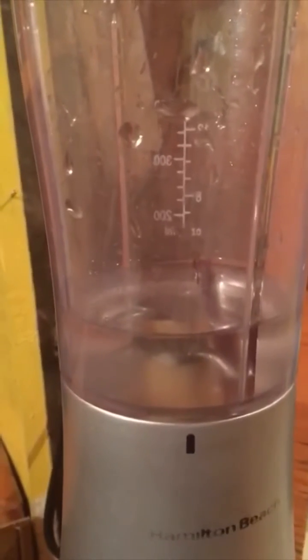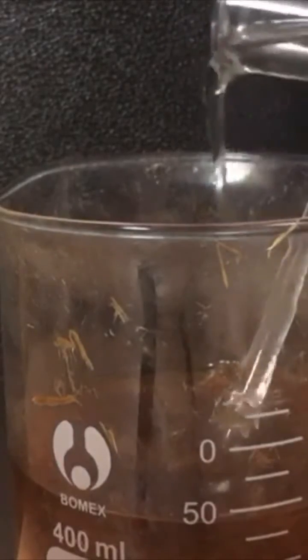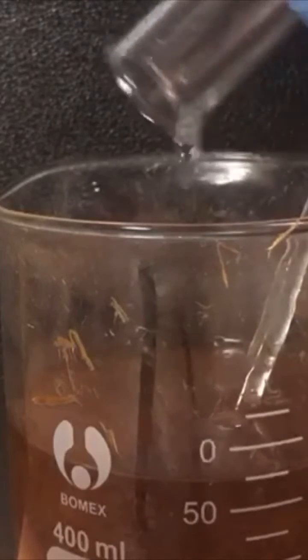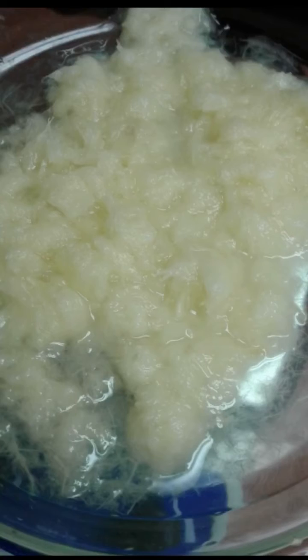Now we're ready to blend. To this we add a 5% sodium hypochlorite solution, adding a little over 25 milliliters. This is to bleach the cellulose. Here I am lightly heating it, and this should bleach it even further. This was looking a bit yellow, so I added some hydrogen peroxide.